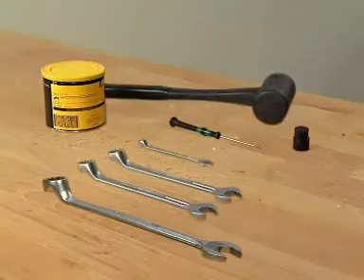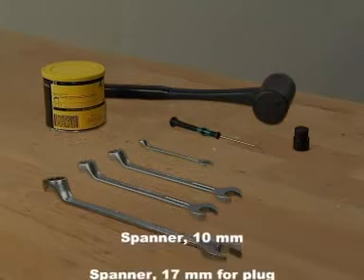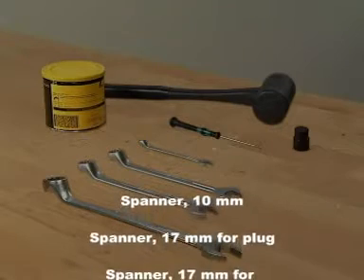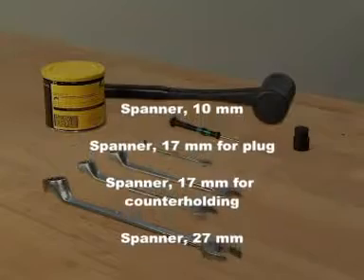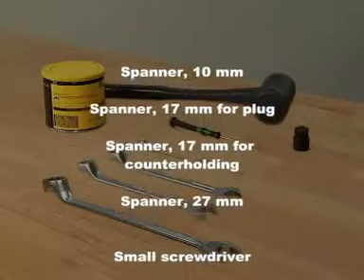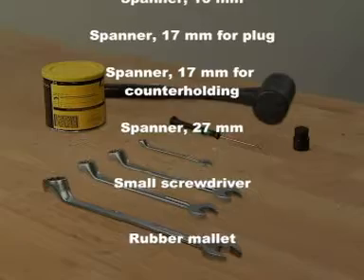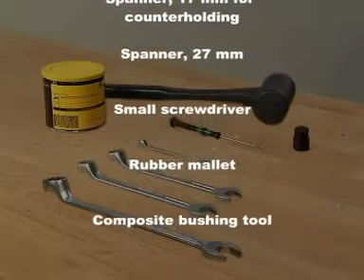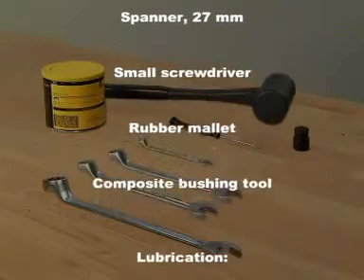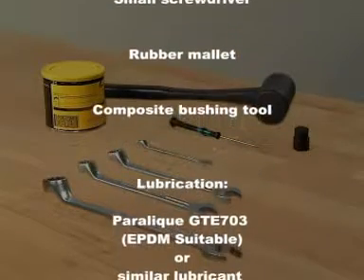Tools required: spanner size 10 for the clamp; spanner size 17 for the plug; spanner size 17 for counter holding the actuator stem; spanner size 27 for the actuator bushings; a small screwdriver for removing the plug seal and releasing the air behind the plug seal; and a rubber mallet for the composite bushing tool.